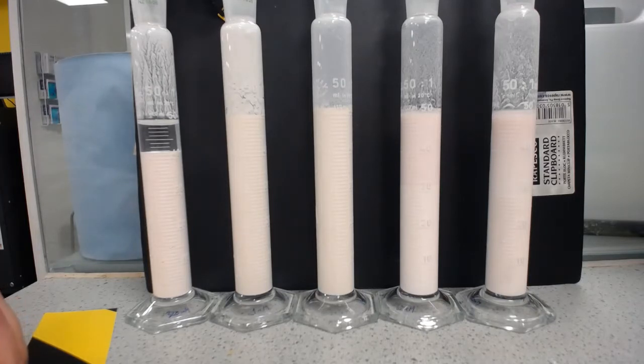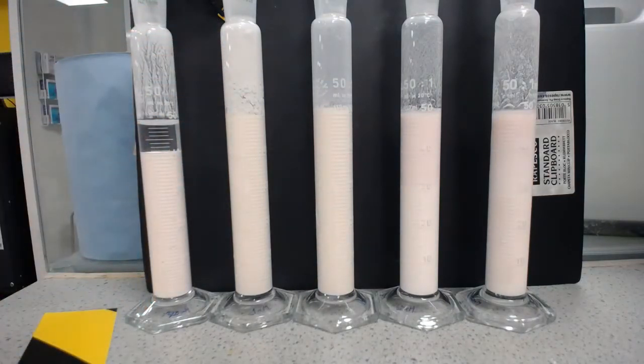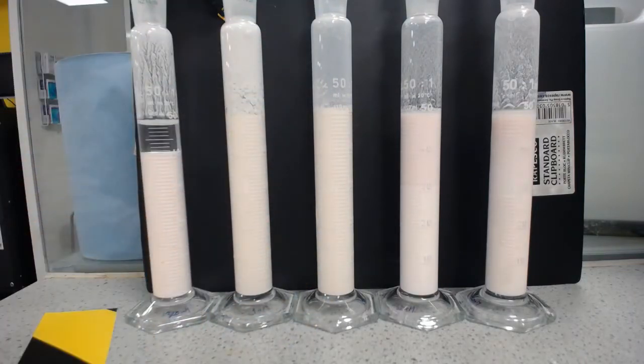And you can see, actually, if you've ever used calamine lotion before, that this one is looking a little bit like how that one does when it dries out at the top here. It goes all crusty, doesn't it? Now, formulation C, again, I can't see any sedimentation at formulation C. So 50 over 50 for that, if we were going to work out the sedimentation volume. It looks really nice, and we haven't even got this sort of cracking and drying at the top of this one. So formulation C is looking pretty good to me.